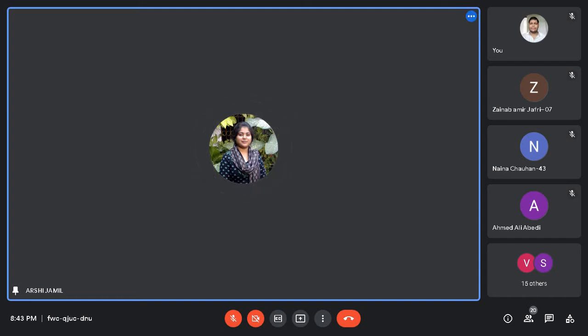उसमें आप देखते हैं based on number कि आपके उस particular sample में कितने seeds ऐसे हैं जो दूसरे crop के हैं, या उस सैंपल में कुछ ऐसे भी सीड्स हैं जो किसी वीड के हों, या कुछ ऑब्जेक्शनेबल वीड्स के सीड्स तो प्रेजेंट नहीं हैं. ऑब्जेक्शनेबल वीड जैसे कि मस्टर्ड में आर्जिमोन मेक्सिकाना, वो आपको ऑलमोस्ट दे लुक सिमिलर एंड इट रिक्वायर प्रॉपर टेस्टिंग. तो आप फिजिकल प्योरिटी जब टेस्ट करते हो बेस्ड ऑन नंबर, so you go for 3 things. First of all you look for the seeds of other crops, then the total weeds that are present, and then the objectionable weeds that are present in that sample.